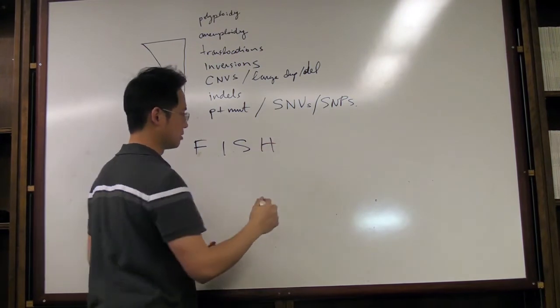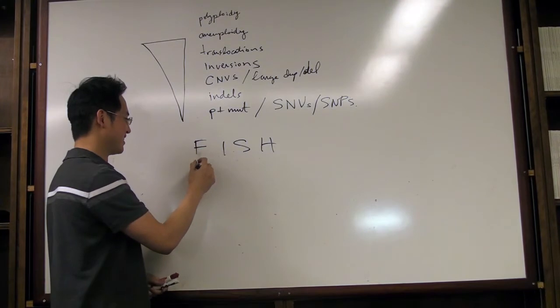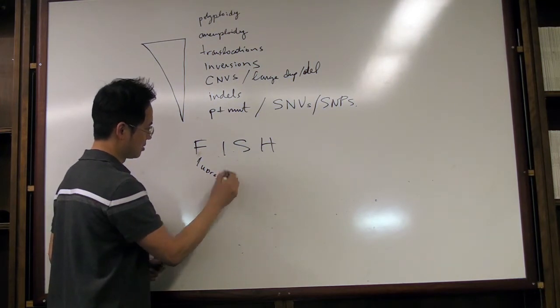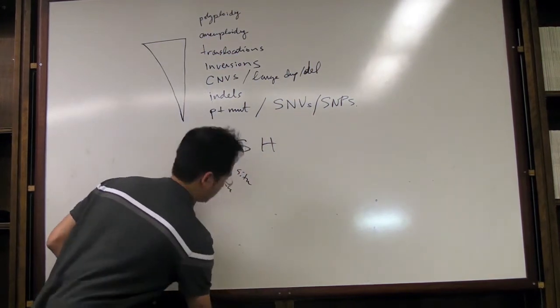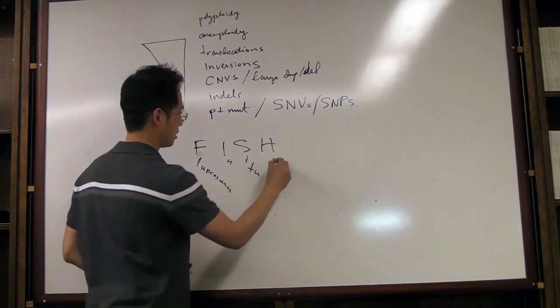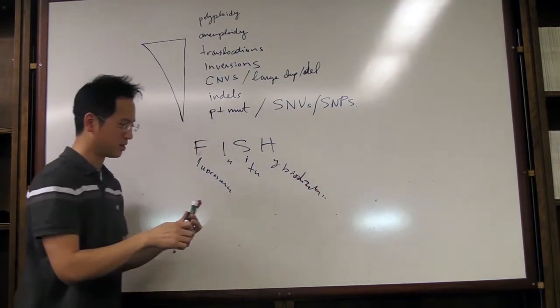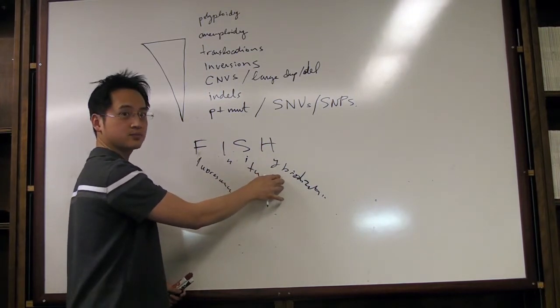any of the texts other than the FISH text, want to guess what this stands for? So fluorescence, right? In situ. Oh, so sorry, that's one word that I wrote. It should be in situ hybridization. I'm butchering the spelling here in the writing. So fluorescence in situ hybridization.